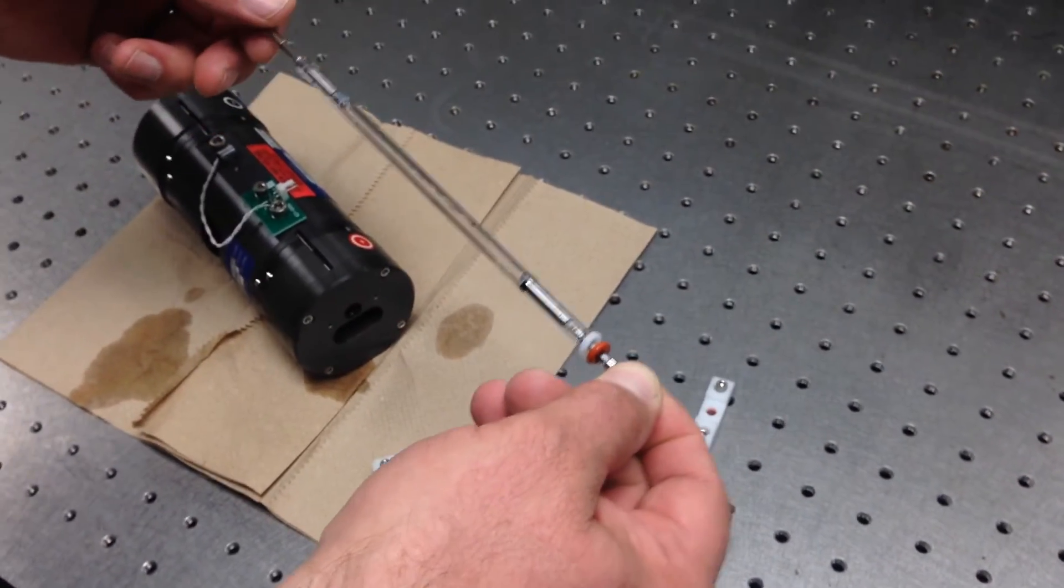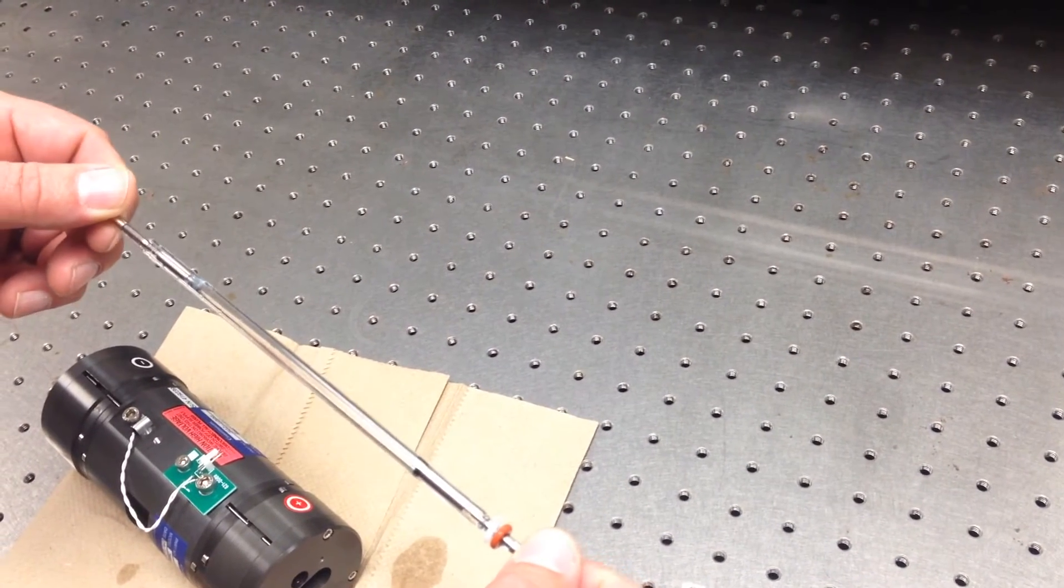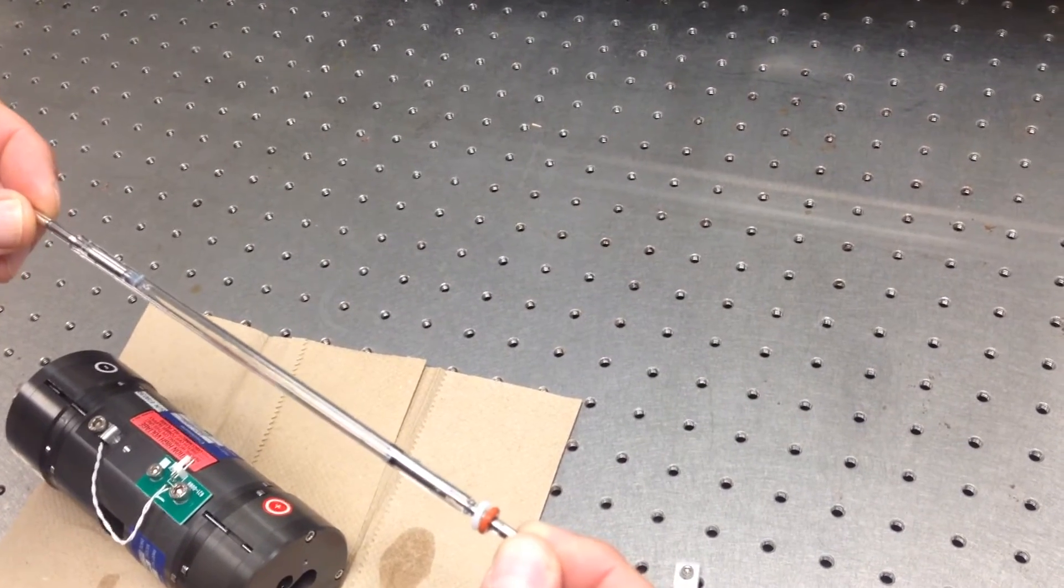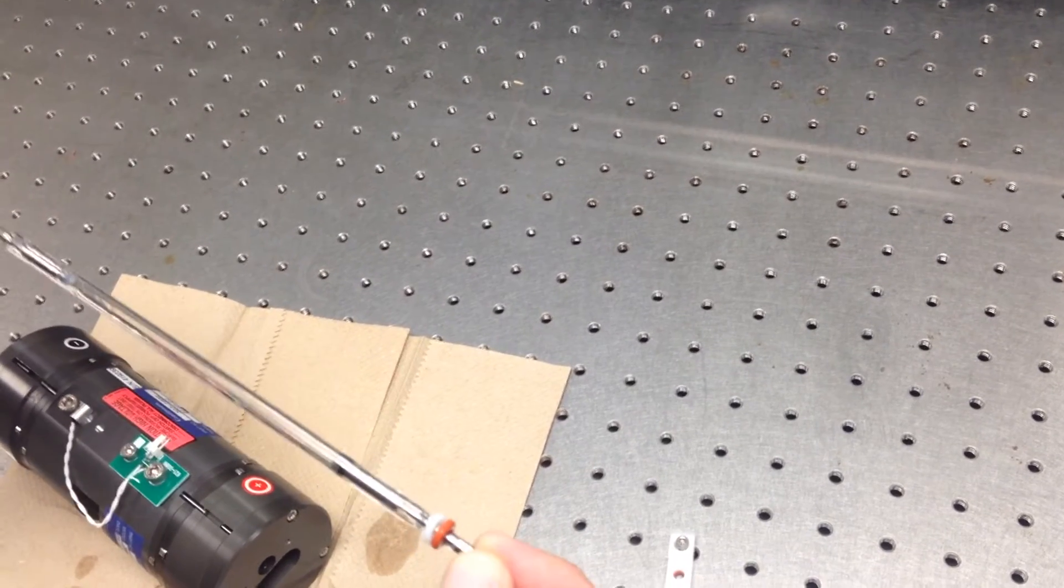And this is your lamp here. You want to make sure that you are not touching the glass with your fingers because the oils from your fingers will decrease the lifetime of the lamp. If you do touch it with your finger, just wipe it off with methanol. You will be fine.